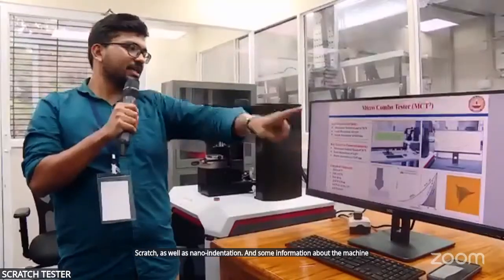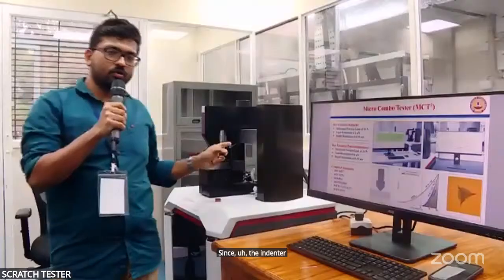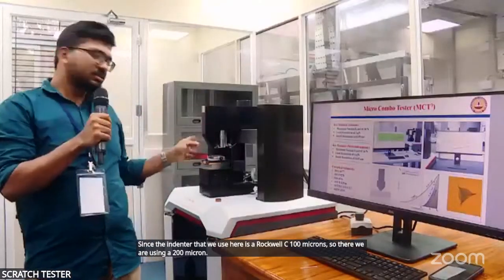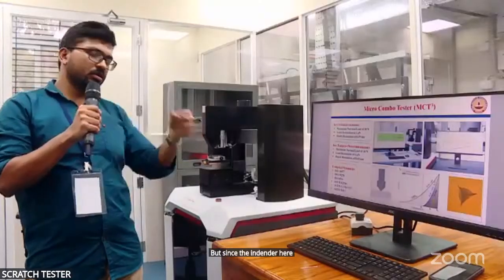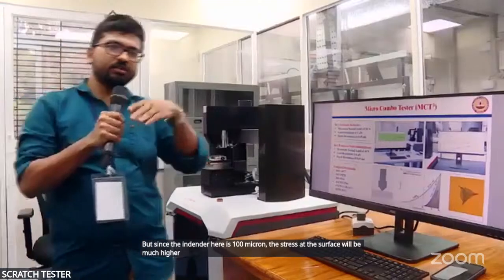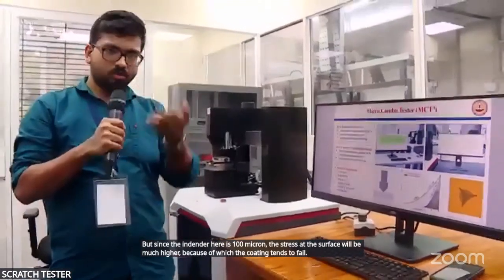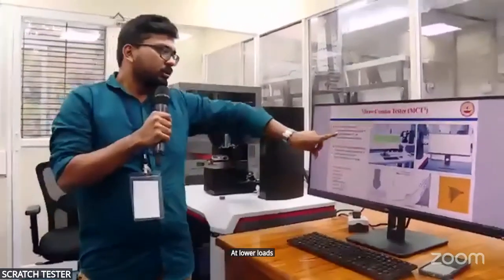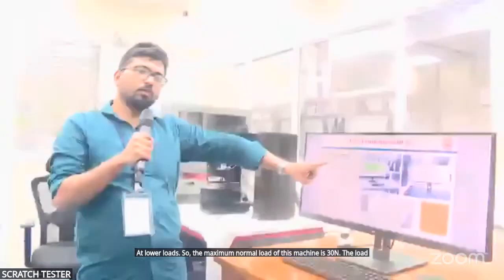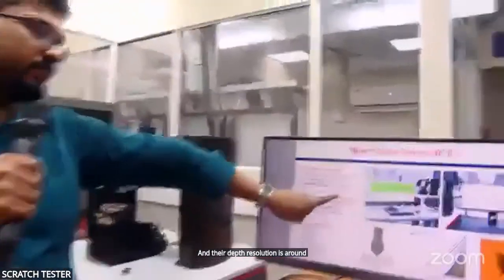Some information about the machine. The load is not as high as that one, since the indenter that we use here is a Rockwell C 100 micron, whereas there we are using a 200 micron. Since the indenter here is 100 micron, the stress at the surface will be much higher, because of which the coating tends to fail at lower loads. The maximum normal load of this machine is 30 Newton. The load resolution is around 1 micronewton, and the depth resolution is around 0.05 nanometer.